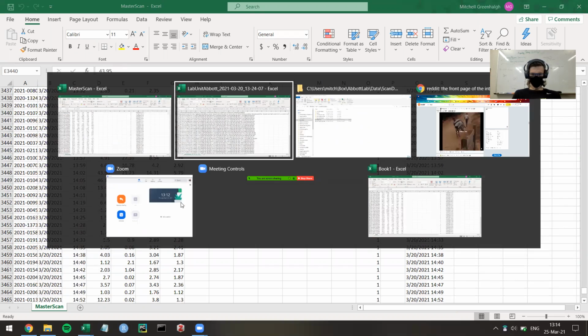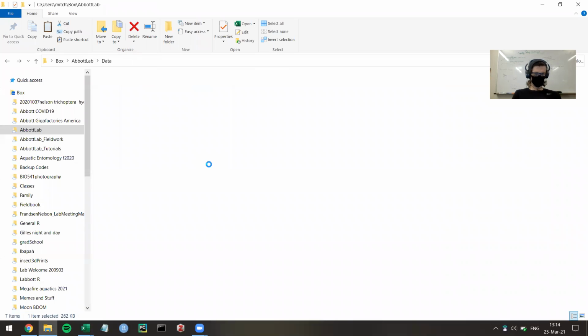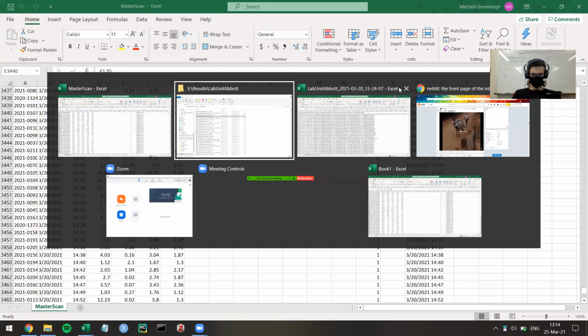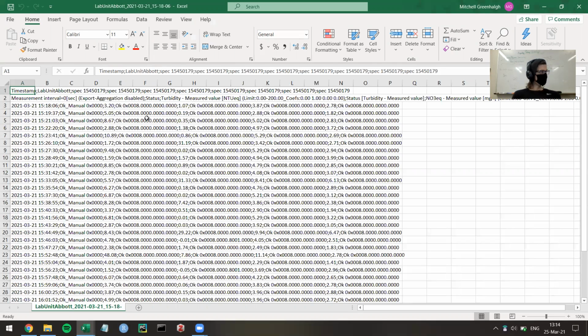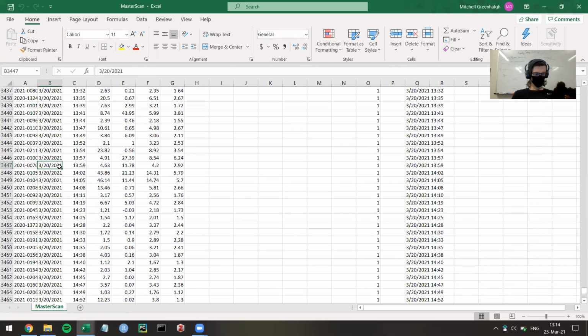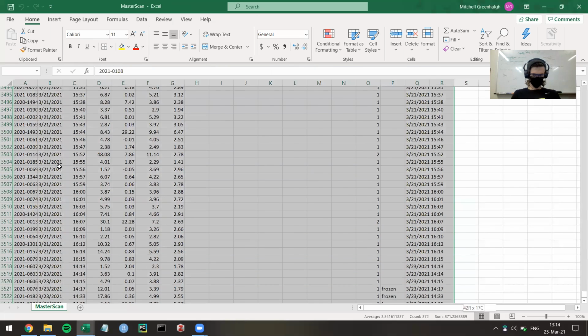So I'm going to go back here, and open up the 3/21. Cool. And then all of the data has already been put in. But I'm going to copy it all over real quick.